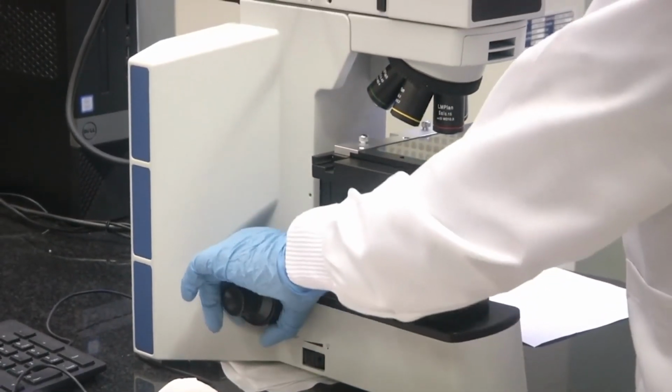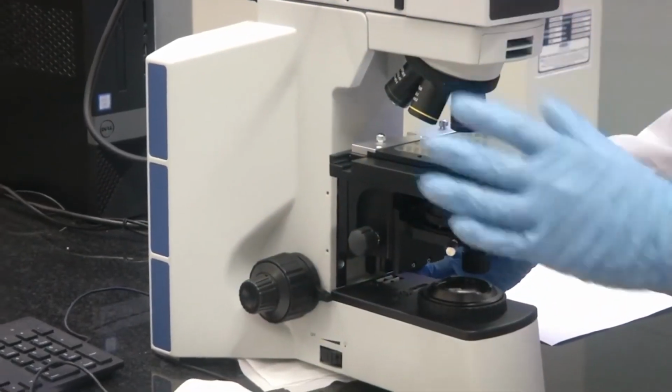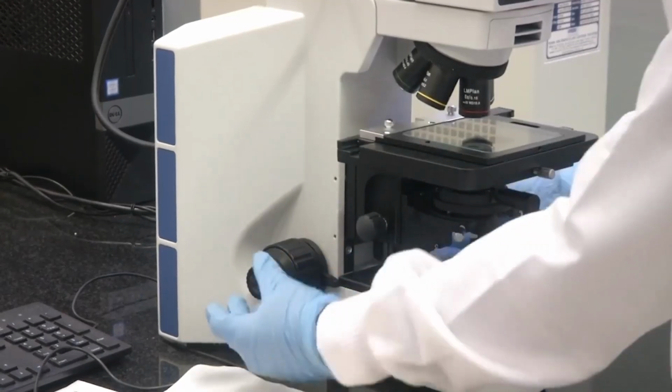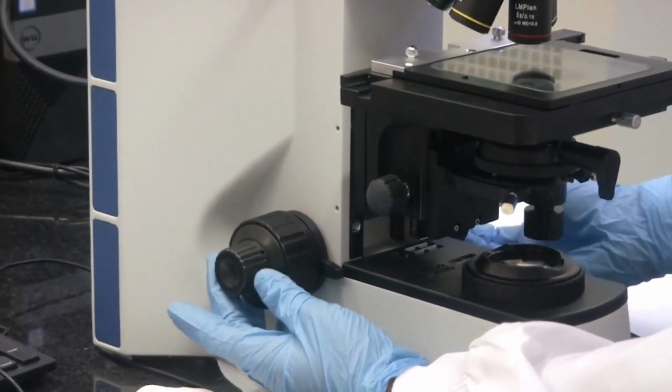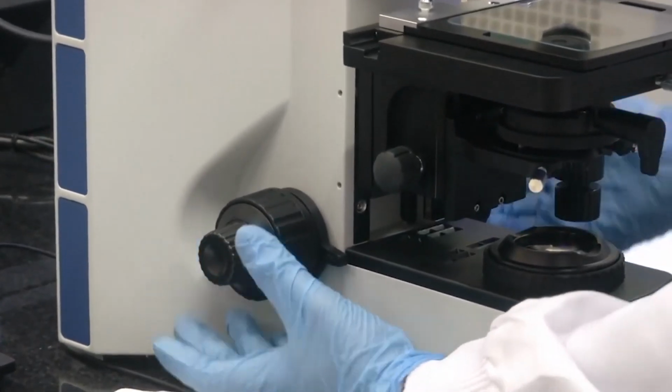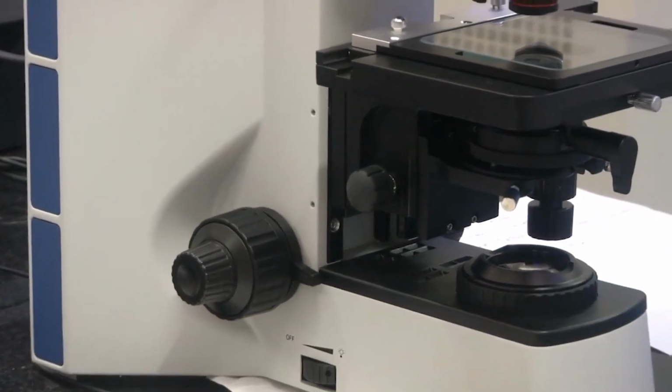So you can have coarse adjustment, and once you know that your sample is reasonably in focus, you need to make it sharper, right? To make it sharper, you have fine adjustment here. This is used for fine adjustment of your focusing. We will see a sample shortly and know how this is done.